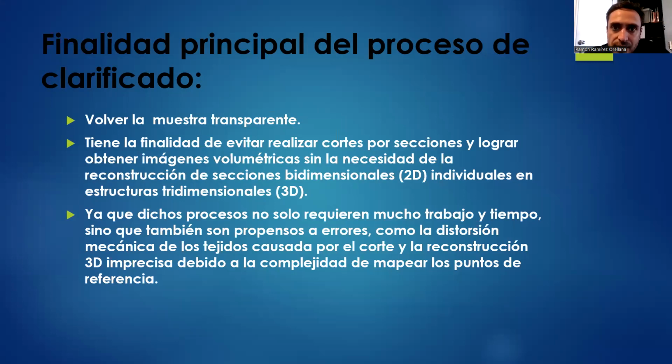Entonces la necesidad de poder obtener una muestra completa surge, y ya tenemos las tecnologías para poder realizar este tipo de técnicas, ¿ya? En base a esta necesidad, se generaron un sinnúmero de técnicas que tienen diferentes características, ventajas y desventajas, ¿ya? Las cuales vamos a ir nombrando una a una, y vamos a ver por qué elegimos la técnica que ocupamos actualmente.